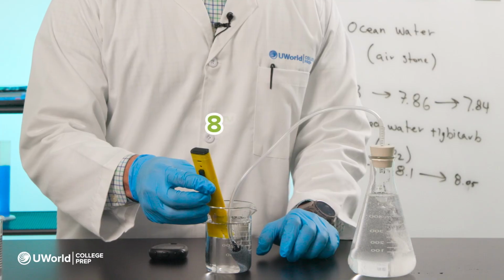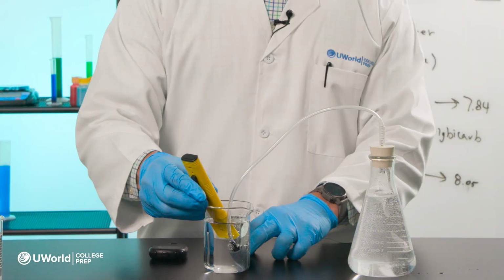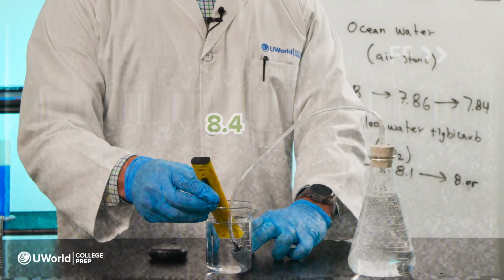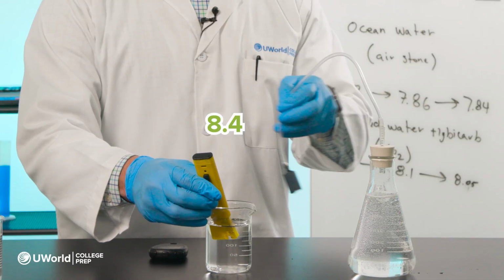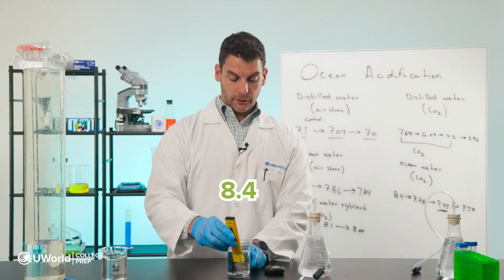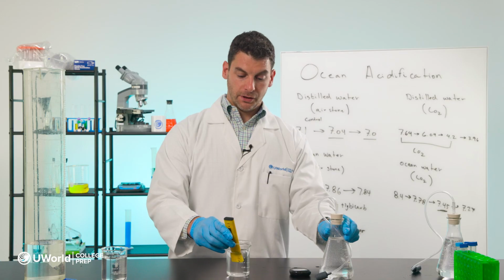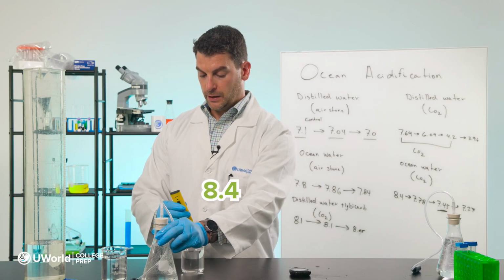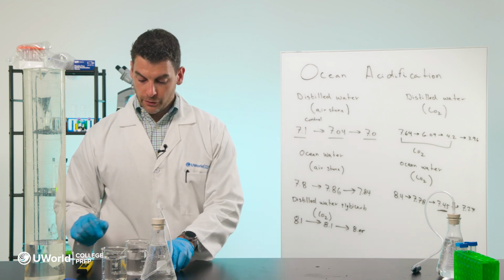Same thing, we're about 8.4 here. And as 30 seconds pass, we're staying at 8.4. And after a minute, we're still there. And at 90 seconds, we're still at 8.4. And after 2 minutes, that pH has not changed. So we stayed at 8.4 throughout the entirety of our salt water with our sodium bicarbonate.